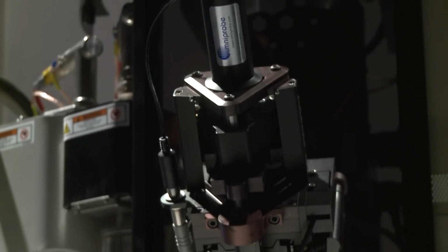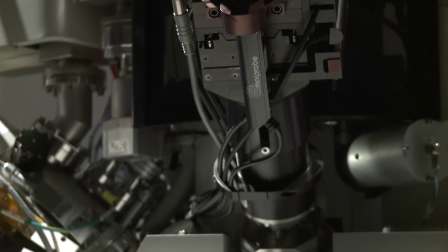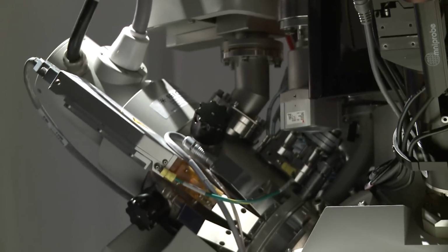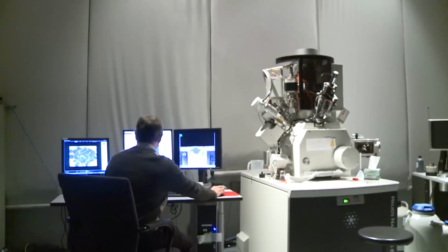This microscope lets us reconstruct an entire cell or a group of cells at very high resolution. And so at this resolution we can see organelles, we can see mitochondria, we can see how the cells are interacting, we can see virus particles inside the cell, and we can see exactly what's going on. And this is a real breakthrough because this is a relatively new technology and it's only recently been applied to biological problems.